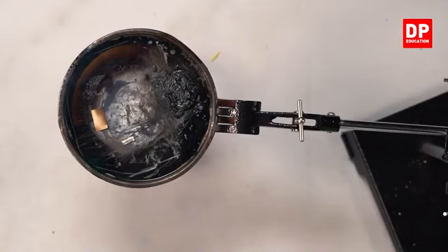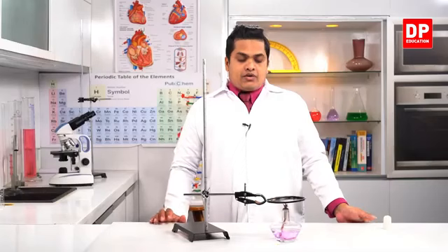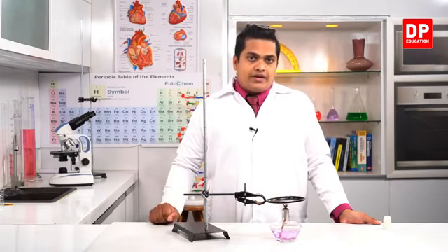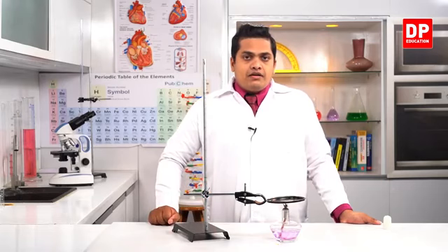So you can see that the matchstick got ignited quickly. Then after that the piece of sulfur, then the cotton wool, then sugar, then the piece of paper. Then the final one, which remained still on the metal plate, is the piece of magnesium. So from this activity we can say that the materials which ignite very quickly have a lower ignition temperature.